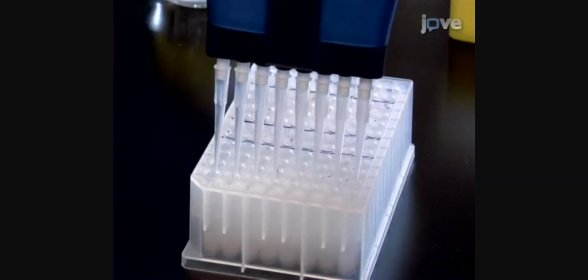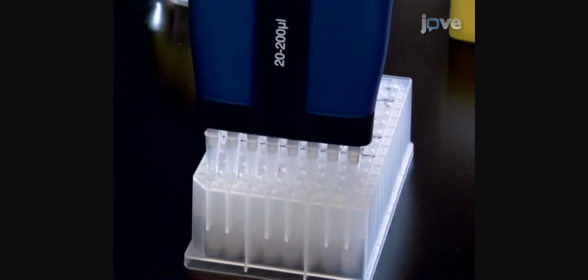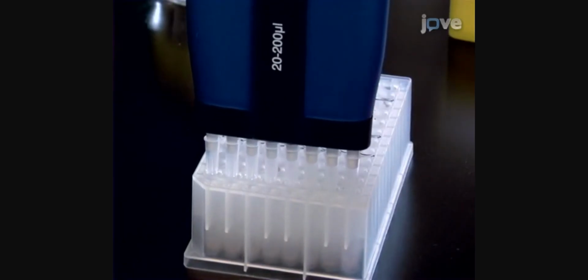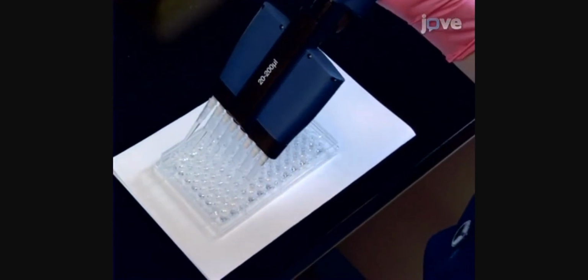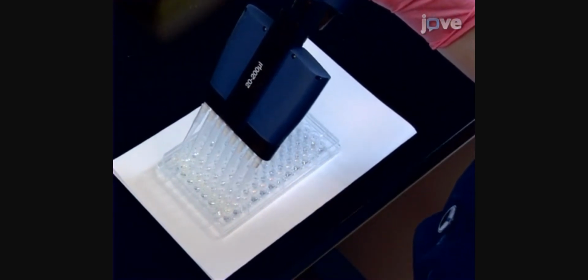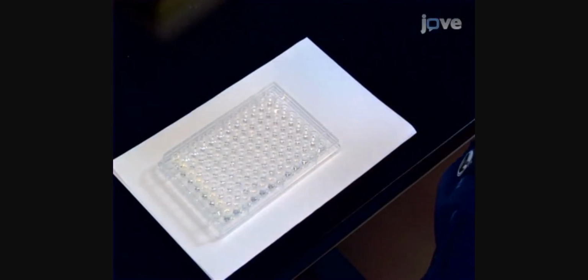Removal of the liquid without disturbing the pellet can be a challenge. One must avoid using too much soil sample initially. Be sure to centrifuge for long enough and use a careful but confident motion to withdraw the liquid. Use a multi-channel pipette to withdraw 100 microliters from each well, being careful to avoid the pellet. Transfer the liquid to the corresponding well on a prepared, clear 96-well microplate.